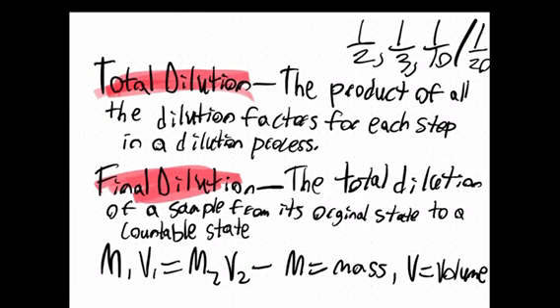So that's a lot of jargon for basically exponents. For a tenfold dilution, our original flask is going to be 1 times 10 to the first, up to, let's just say, the fourth one, which is this flask, sorry for these bad drawings, and it's going to be 1 times 10 to the fourth.